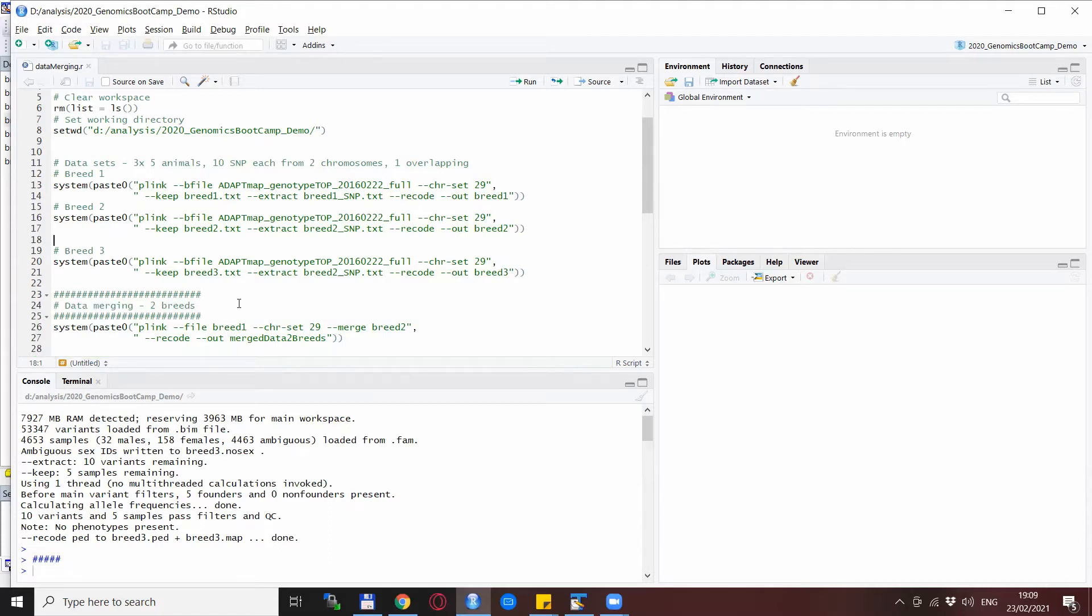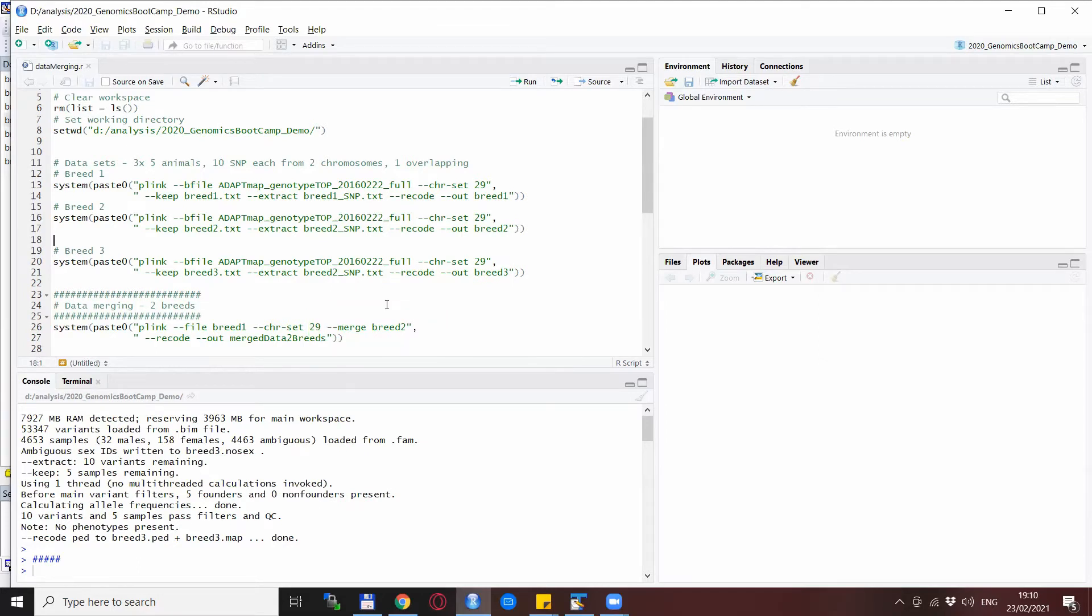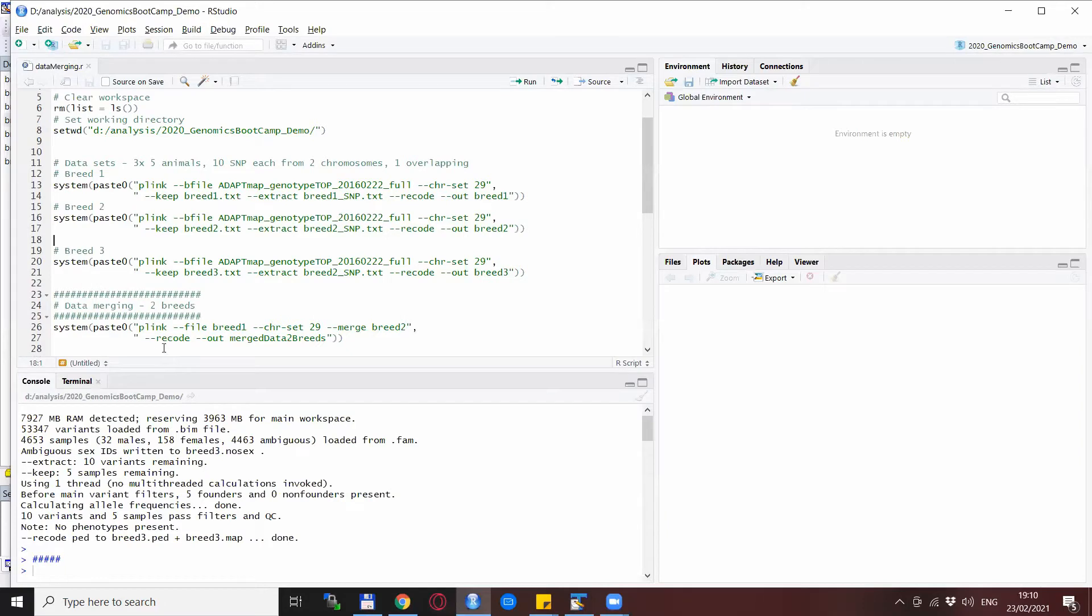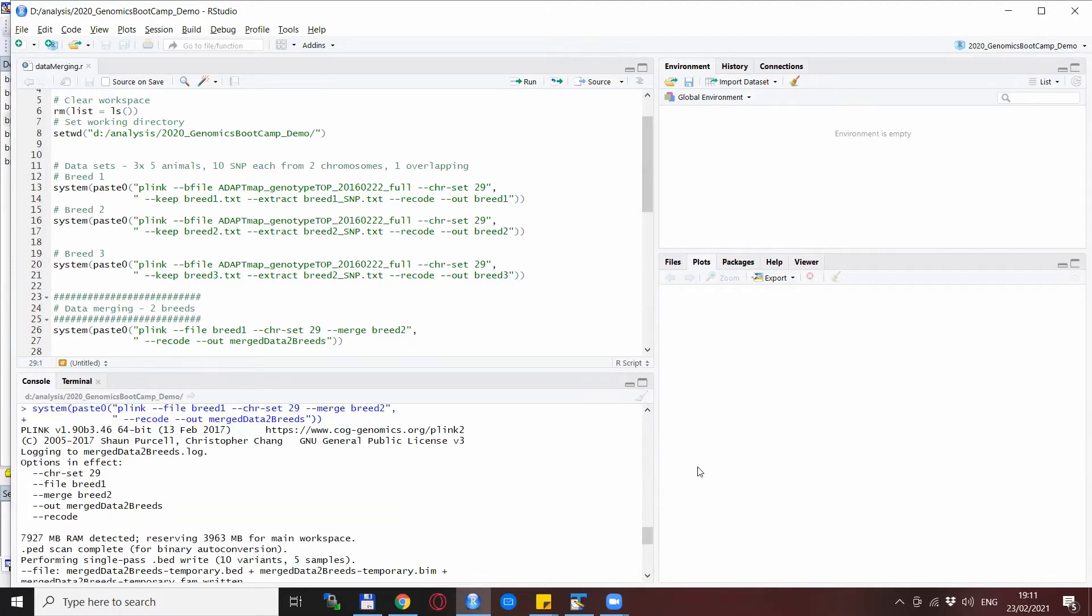We start as usual with the --file statement because we consider the ped files, and then we just say --merge and we specify the name of the other file we want to merge in. We say that we want to have it as a ped and map file again as an output and we provide the name of the output file for the merged file. Okay, so we run the merge line and this is a bit of a longer log file so I will walk you through it.